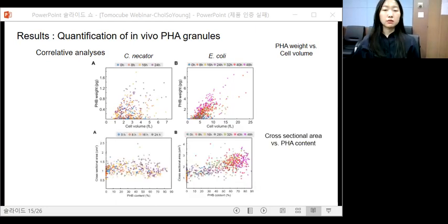Because the average cell lengths are not much different with the culture time, we considered the changes of cross-sectional area of the cells. Look at the scatter plot of cross-sectional area of the cell versus PHA granule contents. In the E. coli case, the cross-sectional area shows a tendency to increase as PHA granules were accumulated, and it was prominent for the cell with more than 15% of PHA granule contents. These results indicate that the E. coli cells are getting thicker with a large amount of PHA accumulation, while the C. necator cell did not exhibit these characteristics.